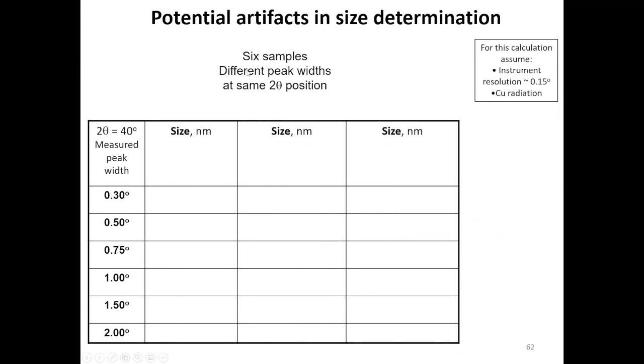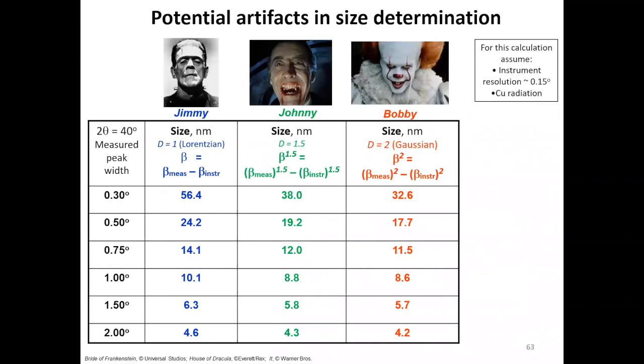If you're dealing with large, broad peaks, the difference is not large, but for sharp peaks it makes a whole world of difference. So in a nutshell, what you actually want to look at when you compare is what method they have been using to actually process the data, and so on. And don't forget to talk to the person who manages your X-ray instrument about what calibration was done for the grain size. Let me move quickly here.